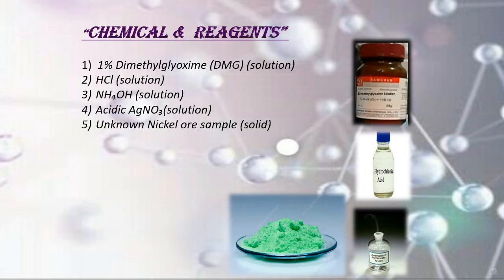Chemicals and reagents. 1% dimethyl glyoxime, hydrochloric acid, ammonium hydroxide, acidic silver nitrate, unknown nickel ore sample.